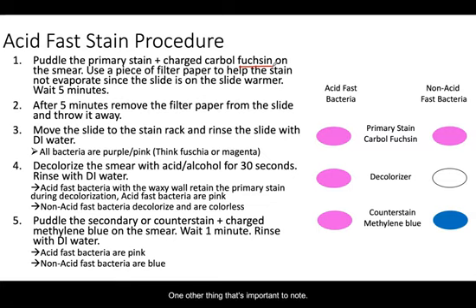And one other thing that's important to note is that acid-fast bacteria are extremely difficult to stain. Because of that waxy molecule called mycolic acid present, they really resist most chemical treatments. And so we have to use a much more strong way to kind of force the dye into them. And so what we do is we not only have a longer period of exposure, and this is as compared to a gram stain, which was a minute for the primary stain.